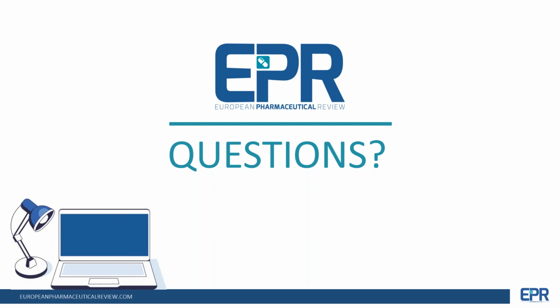Well, the thing is, as I said, each single assay that you performed is validated during the assay.